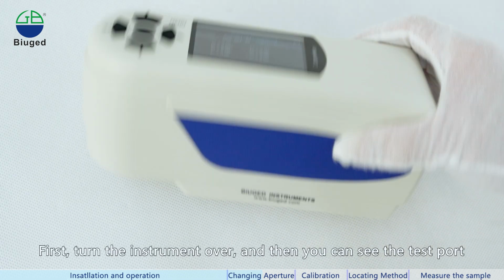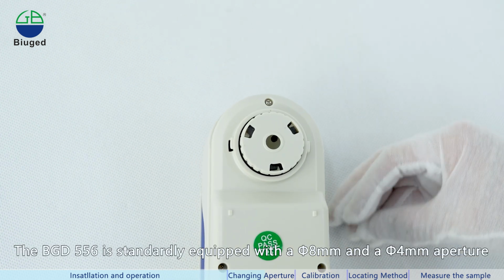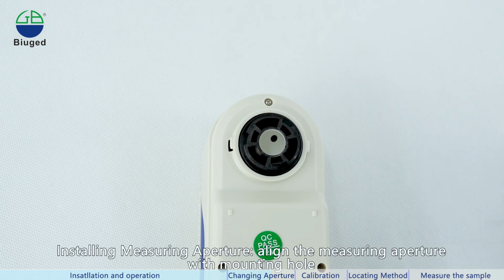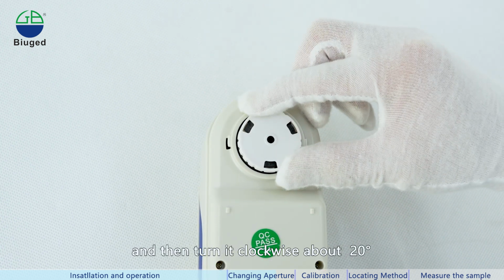First, turn the instrument over, and then you can see the test port. Removing the measuring aperture: turn the measuring aperture counterclockwise 20 degrees, and then remove the aperture downward. Installing the measuring aperture: align the measuring aperture with the mounting hole, and then turn it clockwise about 20 degrees.